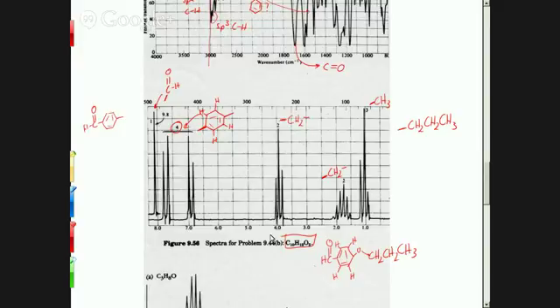Well, the benzene ring has 6 carbons. So if there's 4 hydrogens, that means there's 2 spots left to connect to the other sides. Well, there's maybe 1 attached to each carbon, and then there's 2 spots, one for each side. Right. So then you find the other things in your spectrum, in your product.